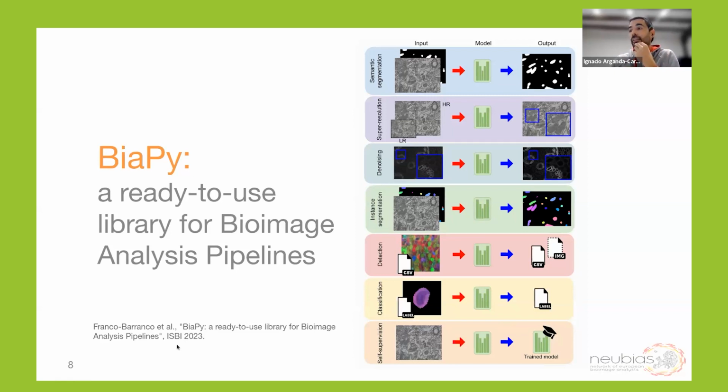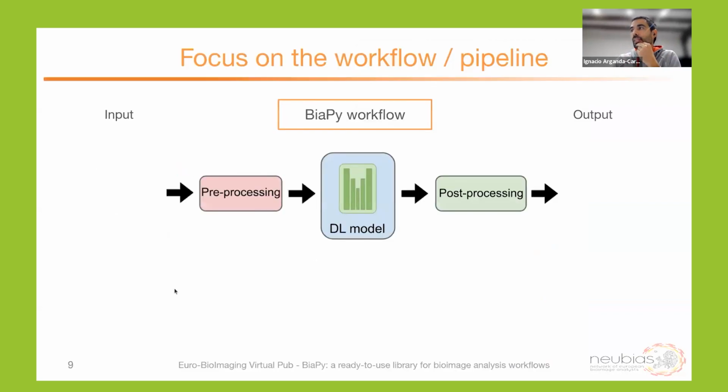So how does it work? Well, the whole focus of BiaPy is, as its name indicates, the workflow, right? Meaning, what do we understand by a workflow? Well, actually, we have three main components. Always at its core, we have a deep learning model.